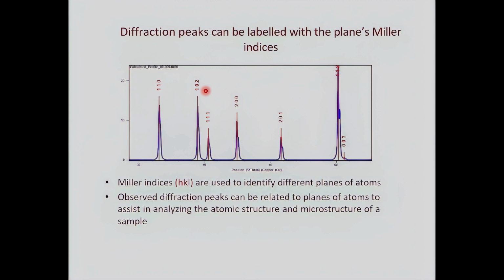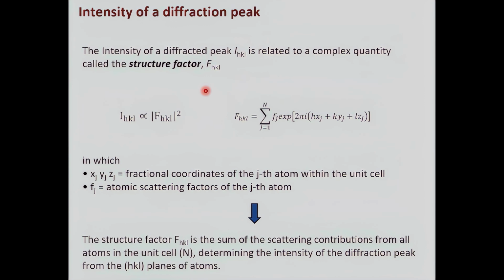What do we need to look at? I have a peak. What is important? To study a crystal, as we will see with the application of X-ray diffraction, very important are the position of your peak and the intensity.